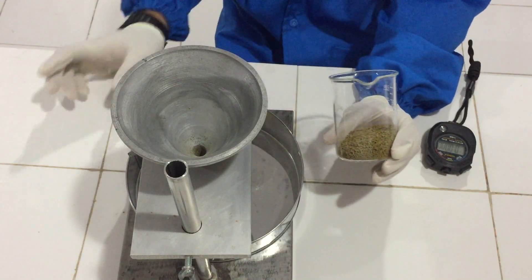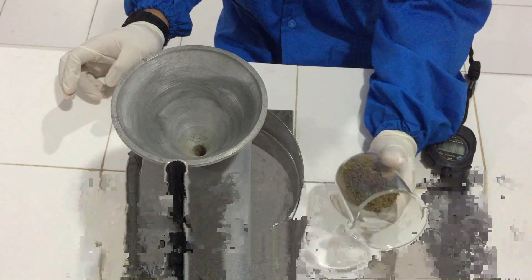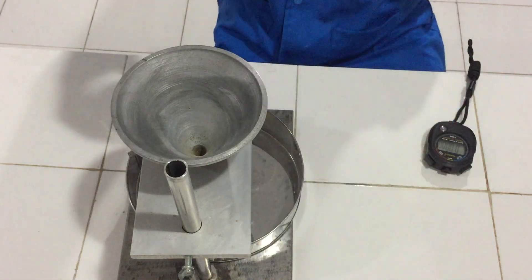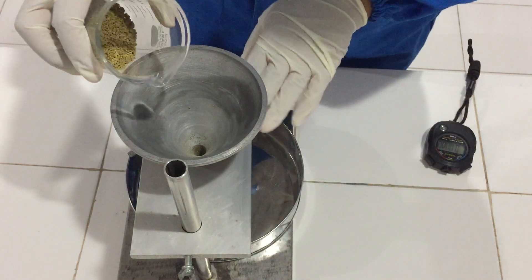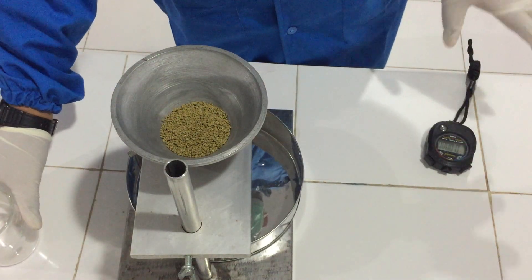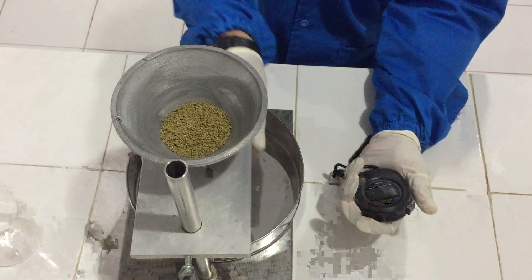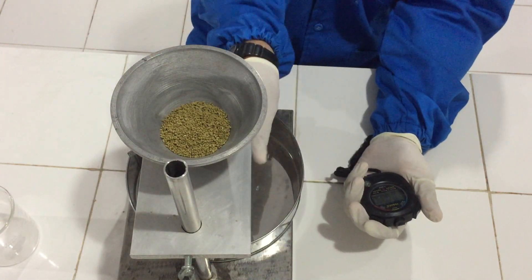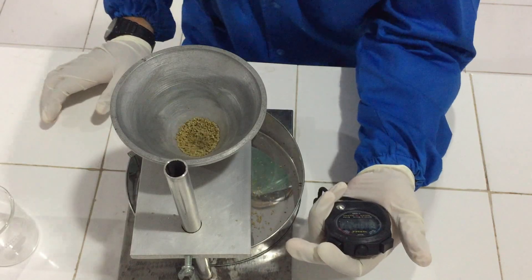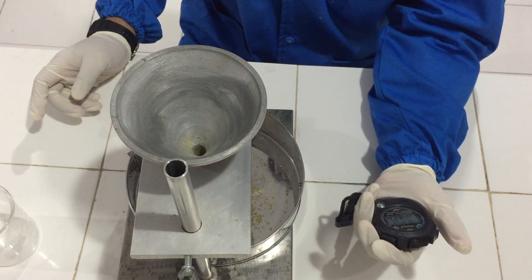Kita sekarang sudah mendapat granul dari percobaan sebelumnya, yaitu granul ekstrak etanol daun kelor. Kemudian hasil dari penelitian sebelumnya, kita akan melakukan uji alir pada granul. Kita masukkan ke alatnya. Untuk uji alir hanya membutuhkan 25 gram granul. Kemudian kita sediakan stopwatch. Kita buka bersamaan dengan stopwatch. Uji alirnya yaitu sekitar 0,035 menit. (The flow rate result is approximately 0.035 minutes.)